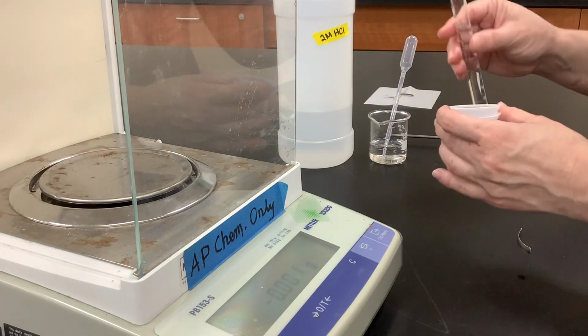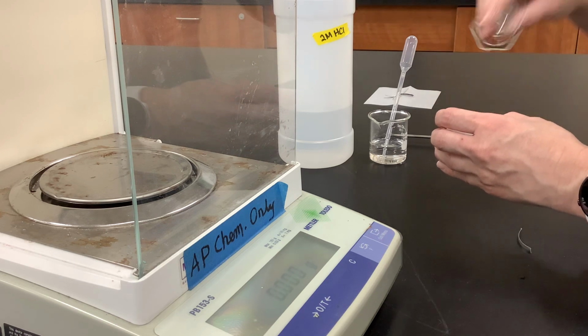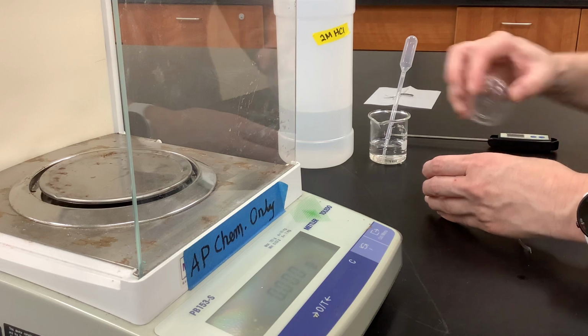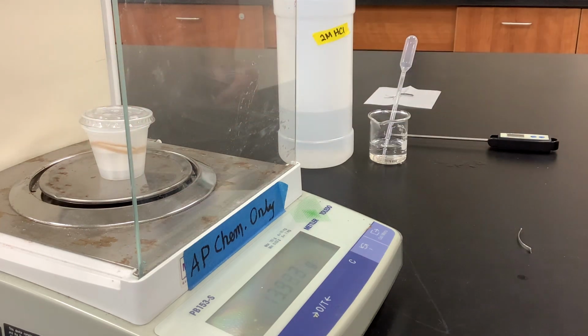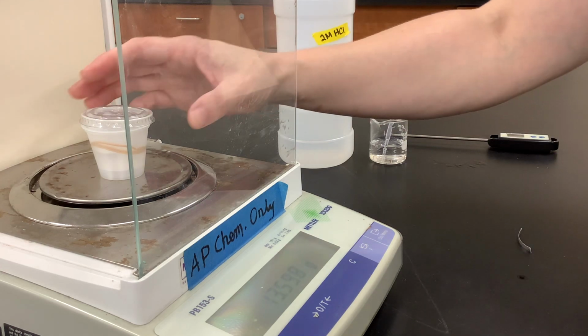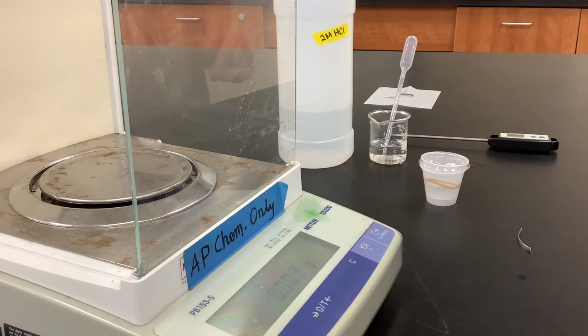I'm then going to add the approximate 10 milliliters of the hydrochloric acid. I'm going to put the lid back on, and then put that back on the zeroed scale. It looks like 13.598. That's the mass of the calorimeter, lid, and 2 molar hydrochloric acid that we added.